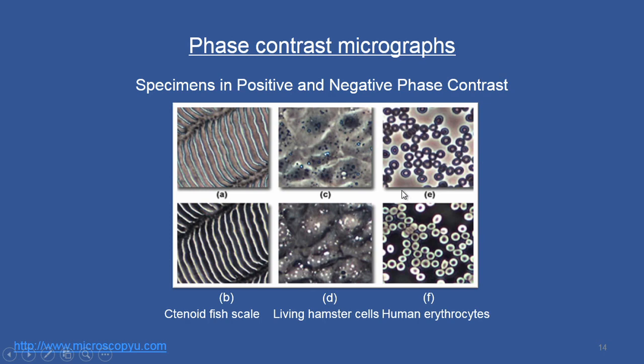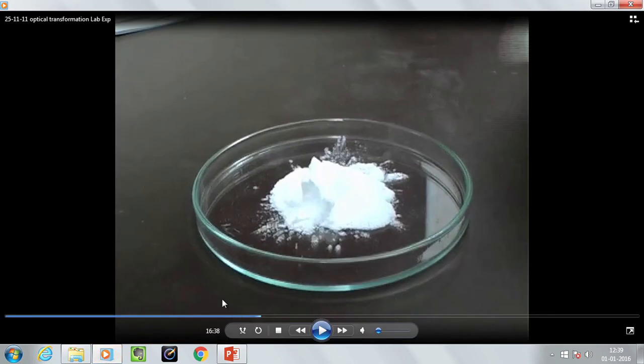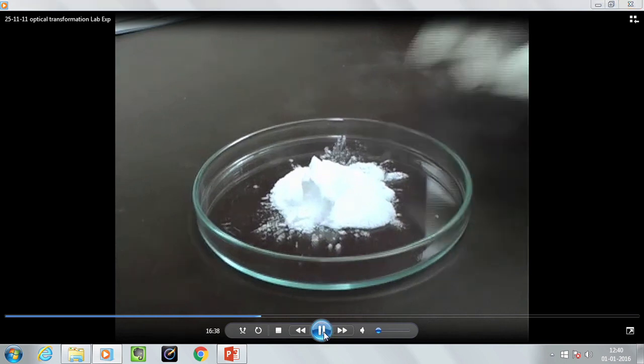So, now let me go to the microscope, and we will look at a live example of how phase contrast microscopy is performed at real laboratory scale.